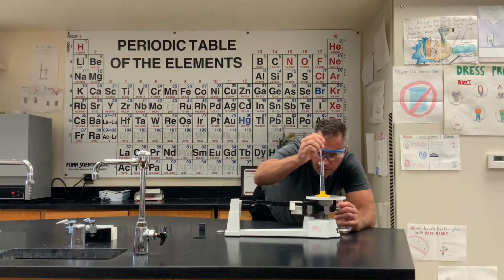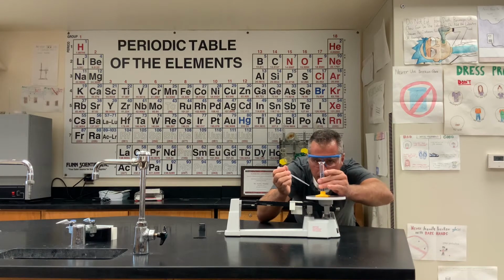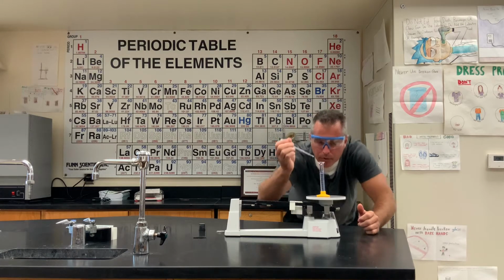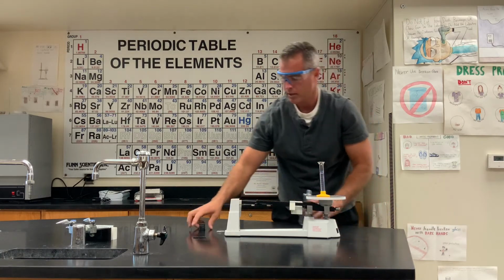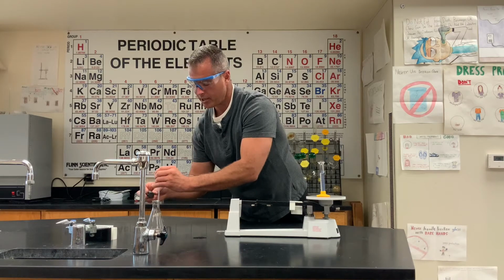Right now I am filling it up to 10 milliliters. And just like we practiced, I want to get that meniscus right on the 10. One more drop. I lied, 2 more drops. Beautiful. So there's our unknown liquid. As always, cap it when you're done.